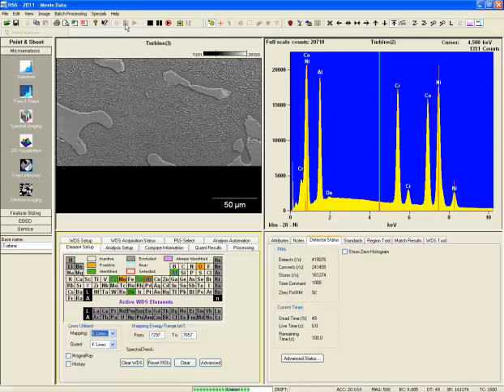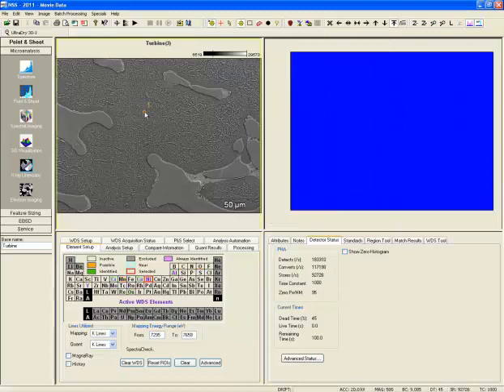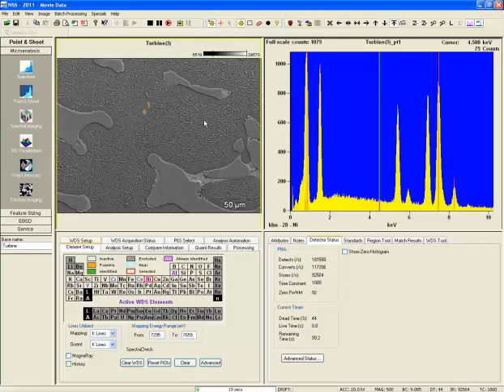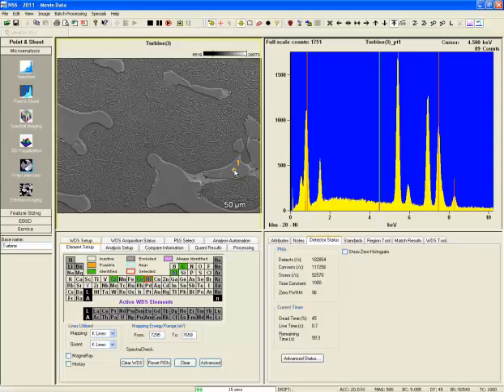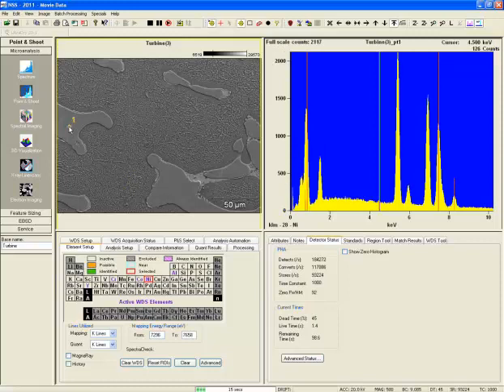Now what we can do is click on the image and start an acquisition and survey around the image, clicking on different locations to see what the spectral shapes look like for those different regions, and to understand the sample even before we're collecting data. As I'm surveying, you notice it is throwing away the previous data point, aborting it, throwing it in the trash, and then collecting a new acquisition at the new location. You can do this for as long as you like.